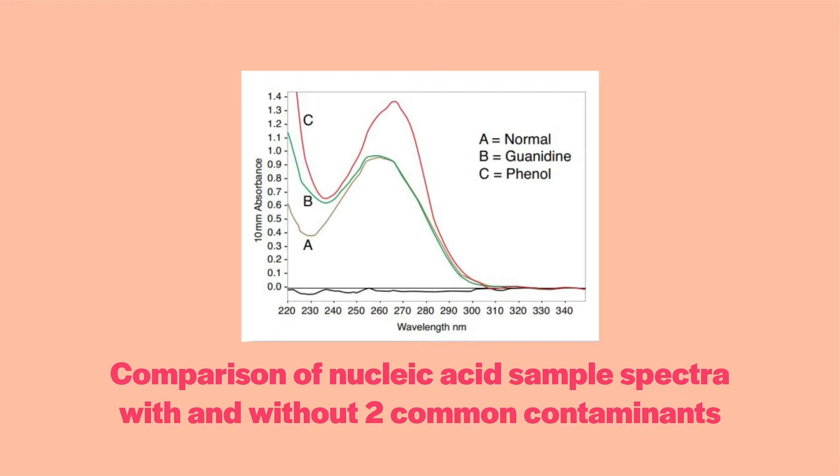This image from Thermo Fisher compares the nanodrop spectrum from pure DNA to some samples with contaminants, guanidine and phenol. The problem with impurities is twofold. First, the impurity can be an inhibitor to a downstream reaction. Secondly, the spectrum of the inhibitor can interfere with your accurate quantitation of your nucleic acids. It is always better to use a sample such as sample A, that shows a good curve and ratios but has less material — perhaps 250 nanograms per microliter — rather than sample C that looks like it has much more material but also contains contaminants.